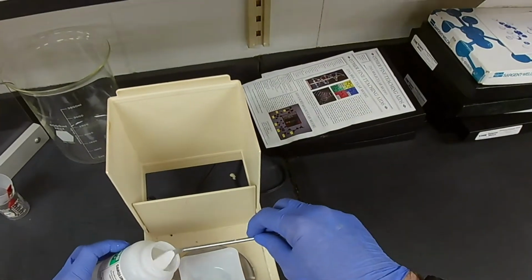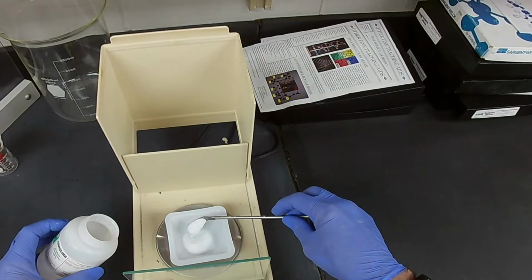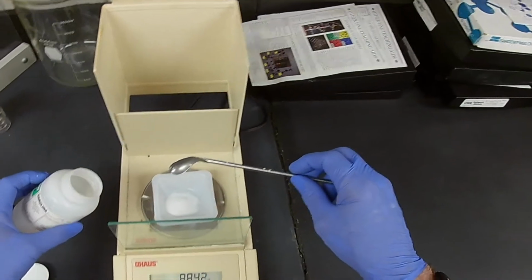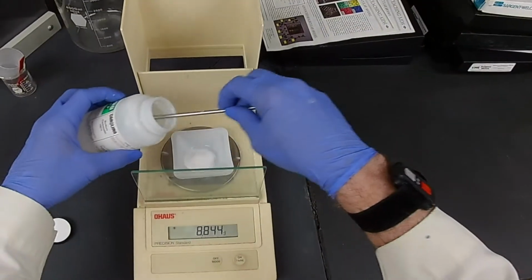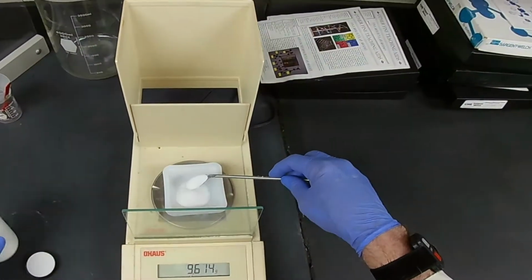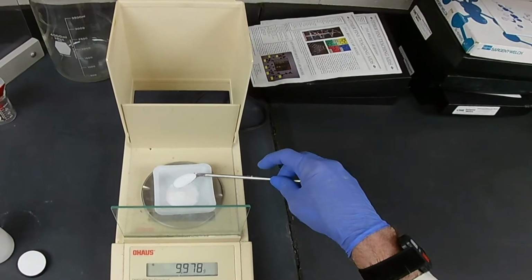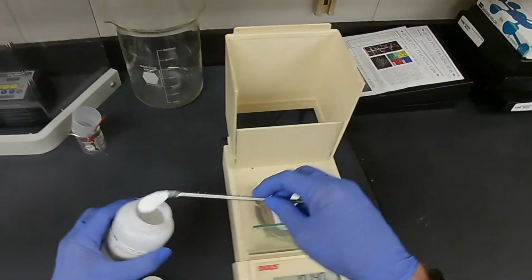We'll get the final weight with the lid closed afterwards. Okay. Another one should be just under. All right. Now we're coming up. Notice how I hold my spatula, almost like chopsticks. Very close. Okay, I went over. That's all right.